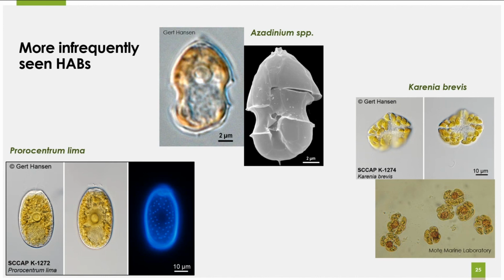micrometers. And then, like I said, Karenia brevis, the species very common in the Gulf of Mexico. Again, we haven't seen it here. Knock on all the wood that we never do. But yeah, it's very similar to Karenia mikimotoi, except that it's compressed and a little bit wider, but it does have these yellow-brown chloroplasts. And then you can see in this image, I like this image a lot. This is from a lab in Florida. You can see the little nucleus in each of the lobes here.